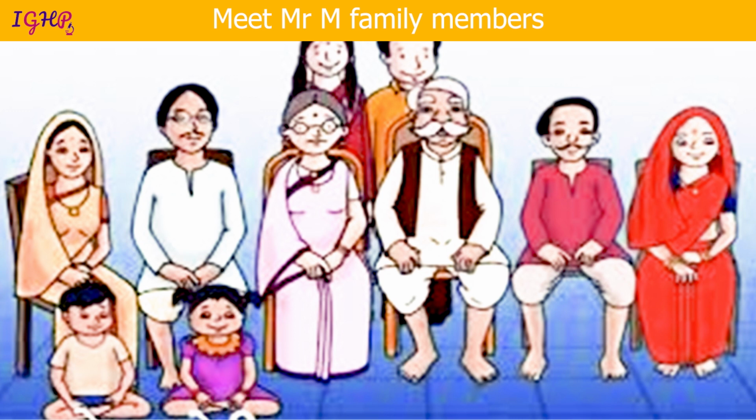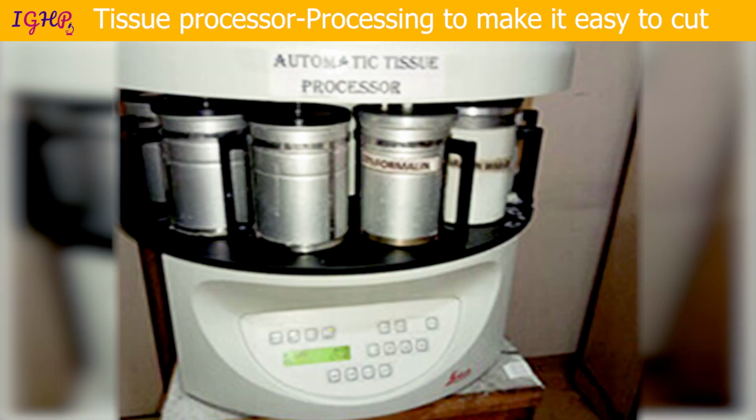because each one of them plays a very significant role in deciding what we are going to look at. First and foremost family member of Mr. M is the tissue processor. This is the biggest machine in the histopathology department, I would say, if you do not have an automatic staining machine. This tissue processor is the area where the tissues are processed after they are grossed.